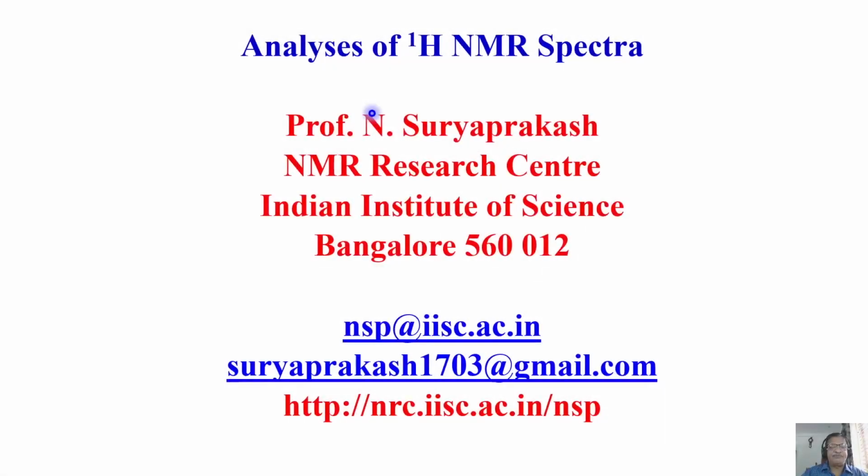Welcome back all of you. In the last class, we started analyzing the proton NMR spectra of some of the simple molecules, which I took as representative examples. Let us now continue further, analyze a few more NMR spectra so that you get more familiarity with analysis.